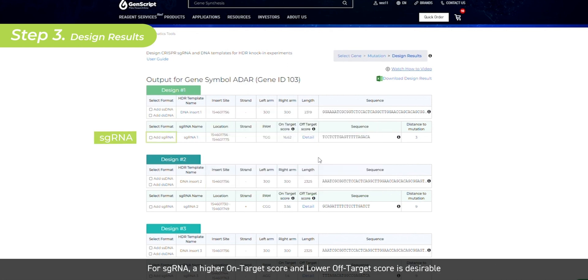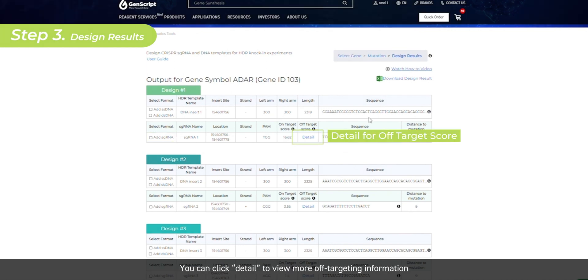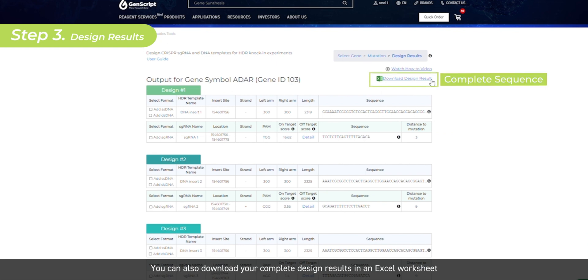For sgRNA, a higher on-target score and lower off-target score is desirable. You can click Detail to view more off-targeting information. You can also download your complete design results in an Excel worksheet.